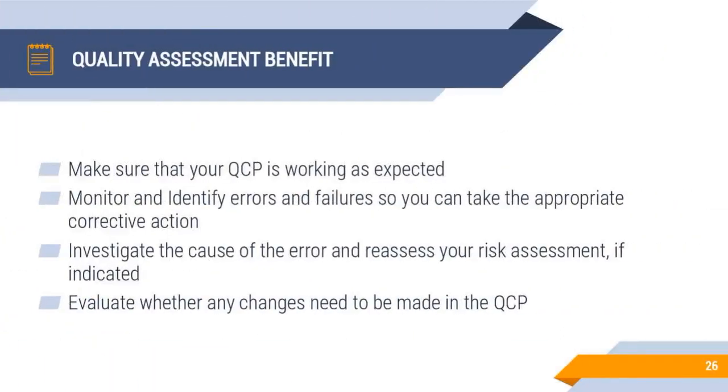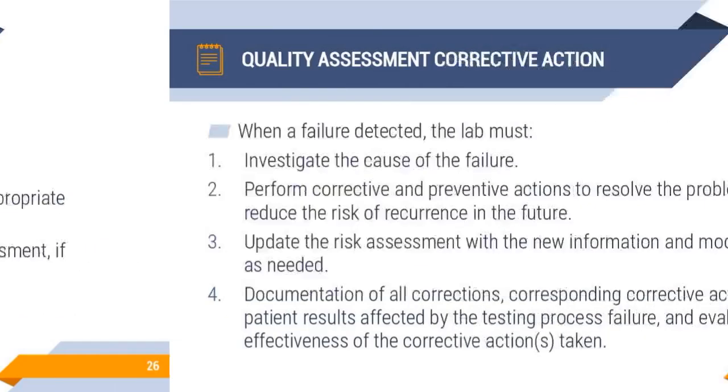Sorry. Quality assessment benefit. Why should I do the assessment? To make sure that your QCP is working as expected, to monitor and identify errors and failures so you can take the appropriate action, investigate the cause of error, and reassess your risk if indicated. This is when I said revisit your risk assessment, revisit your plan, evaluate whether any changes need to be made in your QCP. So this is the benefit.